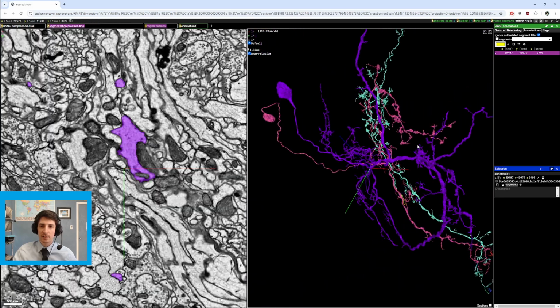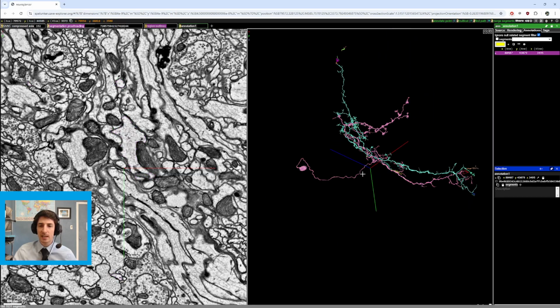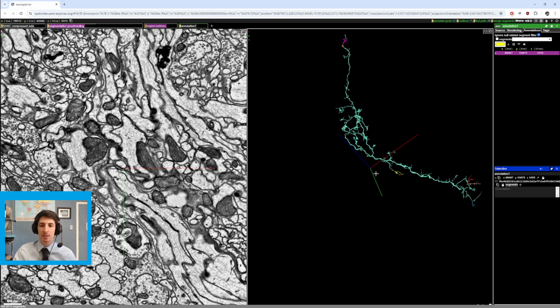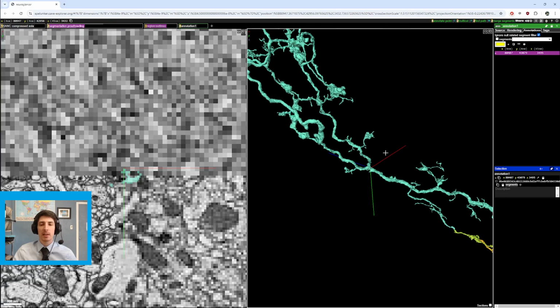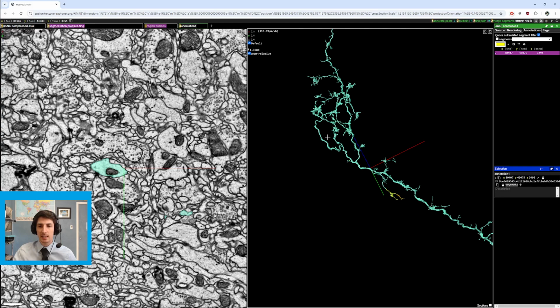It's coming out of this middle area. So we can tell from the cells around that it's probably going to be coming out of that middle area. If you have the prior knowledge of the middle area, you might say, when I look at this, that it's probably in here somewhere.